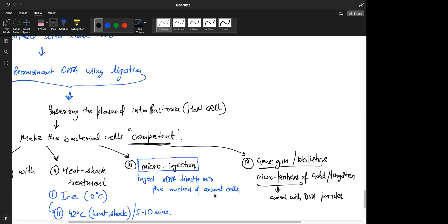They are not major activators of pathways like magnesium, iron, calcium. They can do other physiological things inside the cell. But gold and tungsten are mostly inert particles. They do not react, so that's why we use gold or tungsten microparticles.